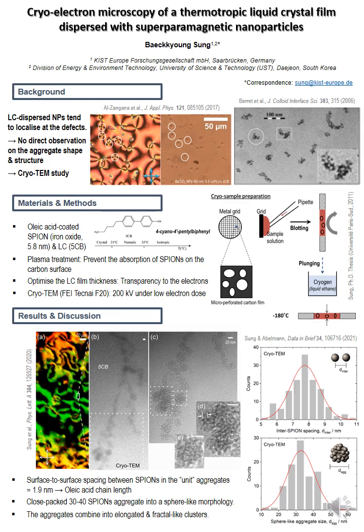Our research promotes the fundamental understanding of how colloidal nanospheres behave in an anisotropic fluid. Furthermore, the data have the potential to be used for designing novel hybrid materials and devices that combine properties of liquid crystals and magnetic particles.